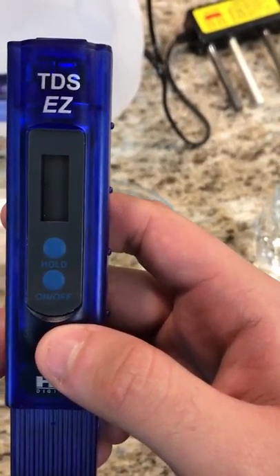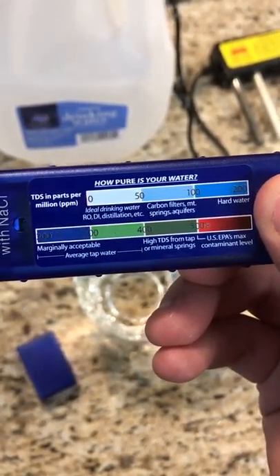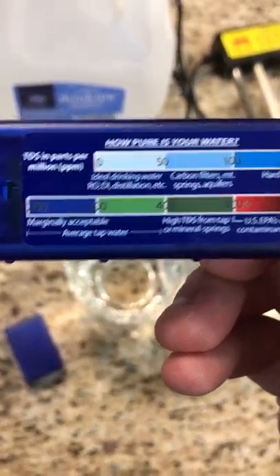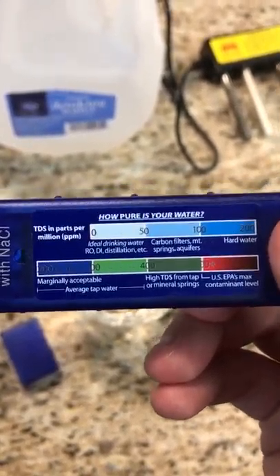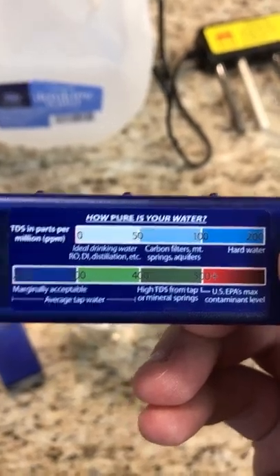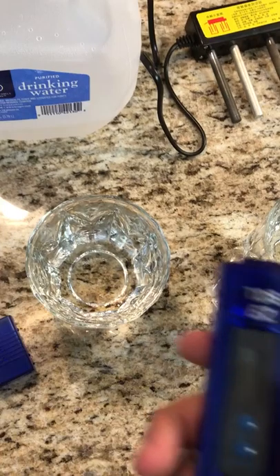For normal drinking water, you should expect it to be between 200 and 400 parts per million, and even then that's kind of pushing it because that's marginally acceptable — you really ideally want it to be much less than that. For distilled water like we have here, you want it to be from zero to 50. The glass on the right will serve as a control so you can see that the device is working.